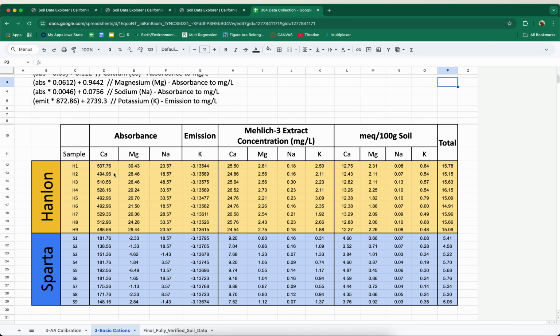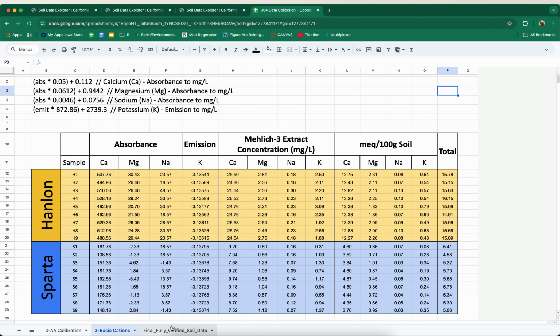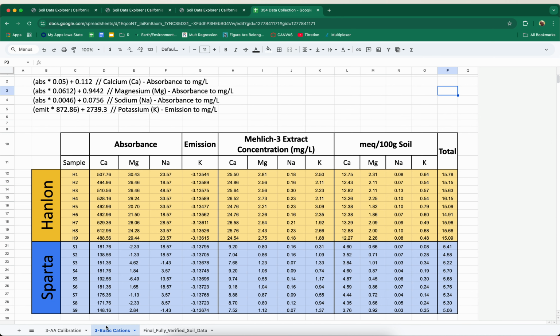So this is a kind of a clean copy because it's easier to look at in a video, but I've got all my calculations in a back sheet here. It's a little dirtier to look at, but you can see some of those longer decimal places that we needed to fill the range of that AA, which is a fairly accurate piece of machinery. I just trimmed some of those decimals in this view here.